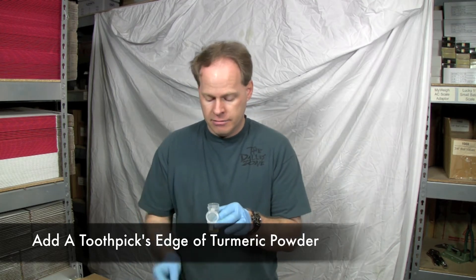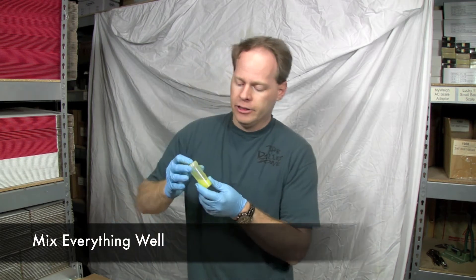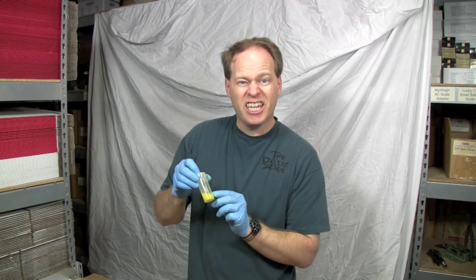Stick it in there and shake this up real good. You'll notice that it turned my oil a yellow color. So let's go ahead and titrate and show you what happens.